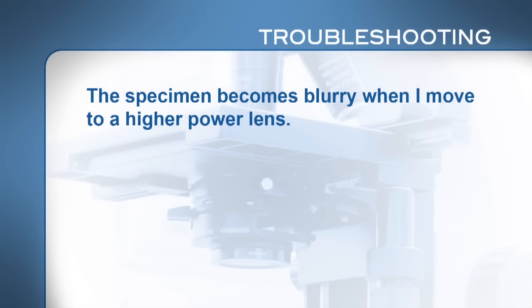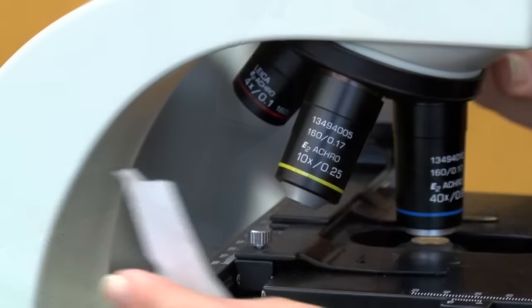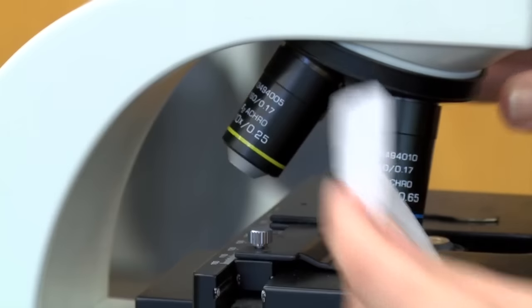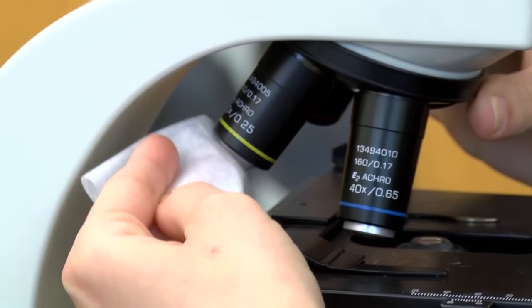If when you move to a higher power lens the specimen becomes blurry as though it were coated with Vaseline and you cannot focus, you may need to clean the lens. Soak a piece of lens paper, and only lens paper, with lens cleaner and wipe the lens. Then wipe dry with clean lens paper. Repeat a couple times. If this doesn't solve the problem, check with your instructor.